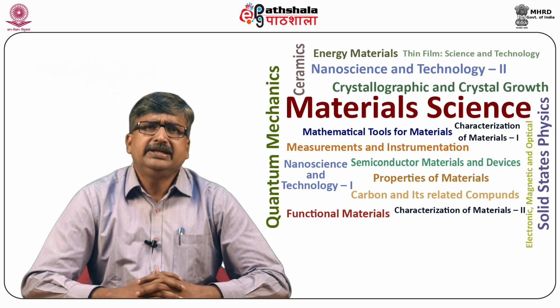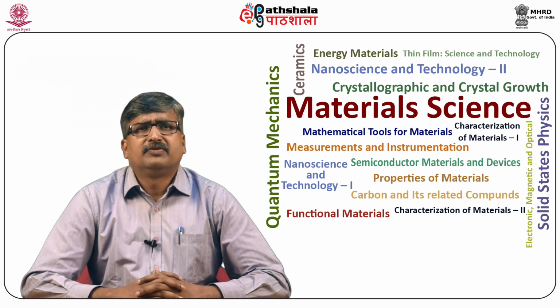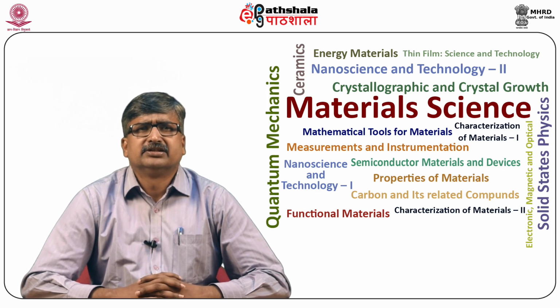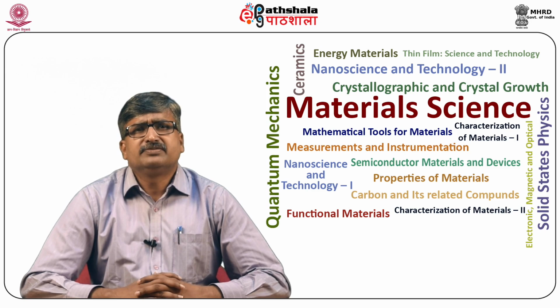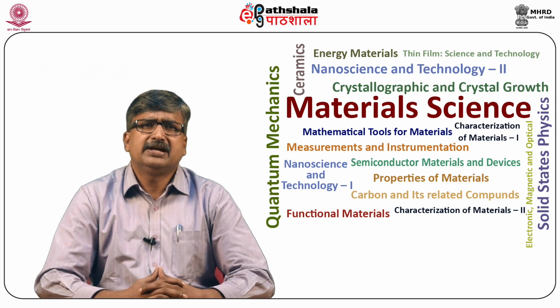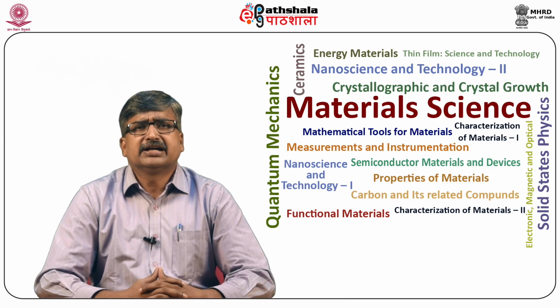Currently, there are many detection techniques available for CE detection, such as absorbance detection, fluorescence detection, electrochemical detection, conductivity, and mass spectrometry, etc. In this, UV-visible absorbance detection and fluorescence detection were discussed. Let us discuss fluorescence detection. The most widely used CE detector is based on fluorescence, using either an arc lamp or a laser as an excitation source. This highly sensitive and selective detector is especially important in biological applications.